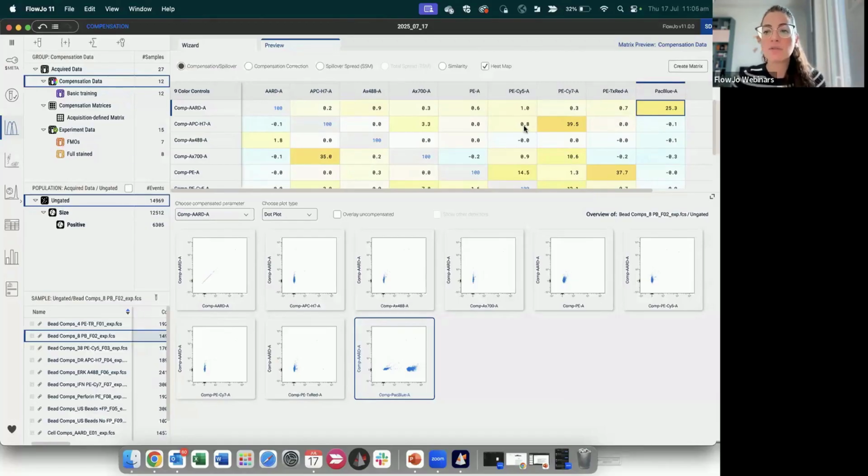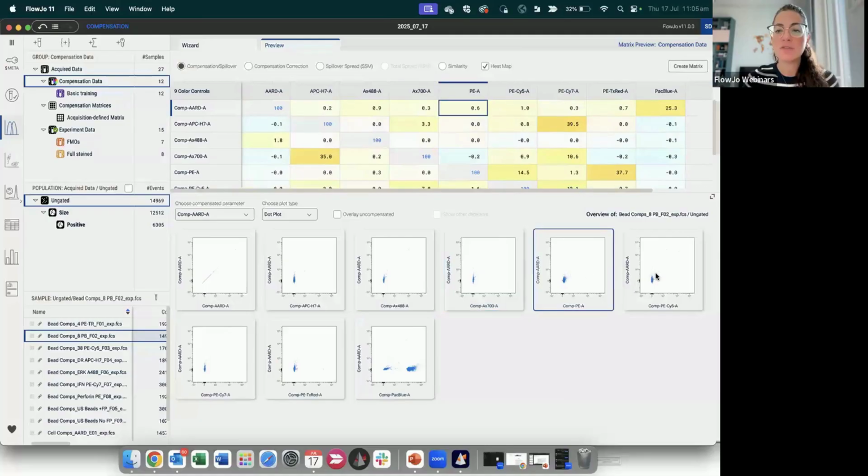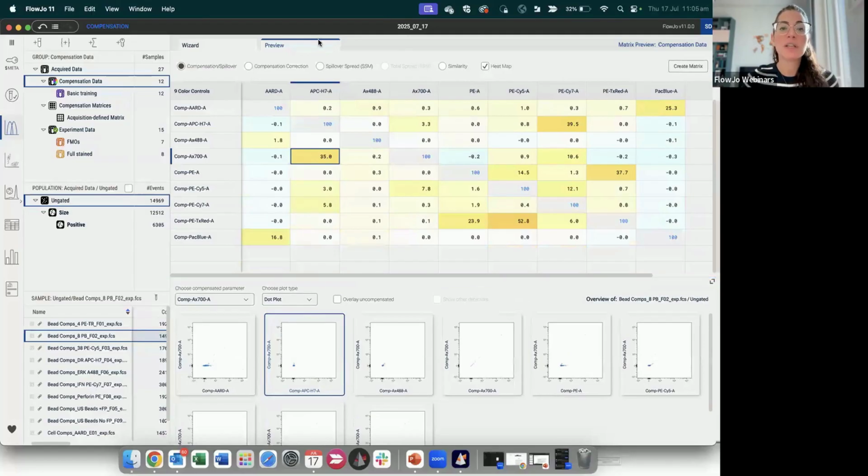So now I don't have to scroll anymore trying to find what is what. I can just navigate onto my samples and highlight that automatically. And it works exactly the same way if you just navigate onto your matrix right here. Once I'm happy with the matrix, I can then create the matrix itself.